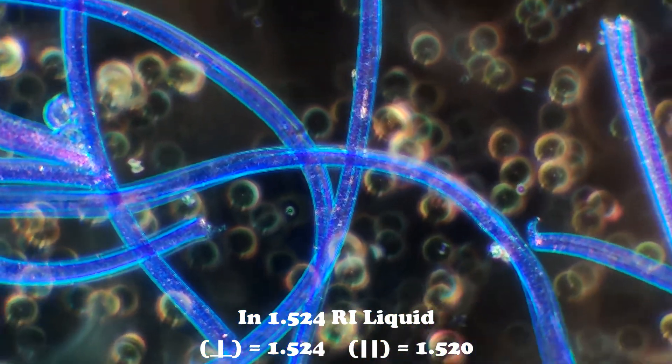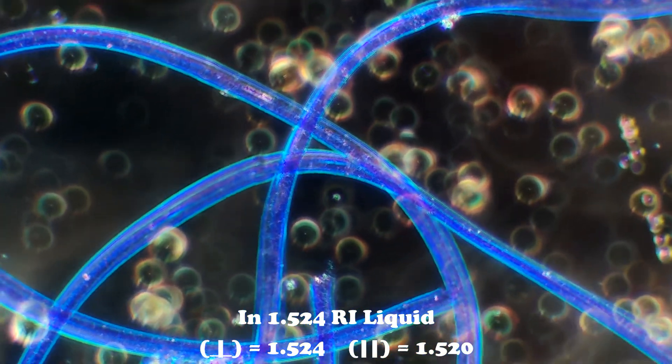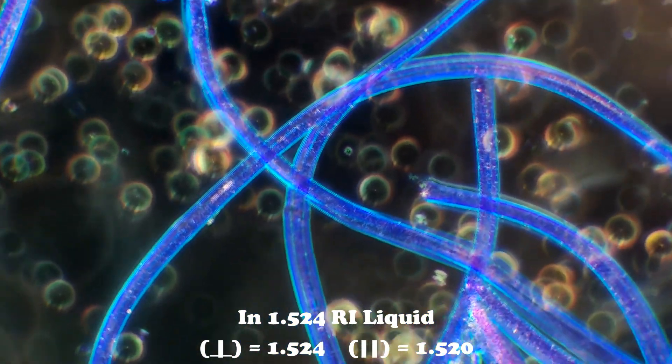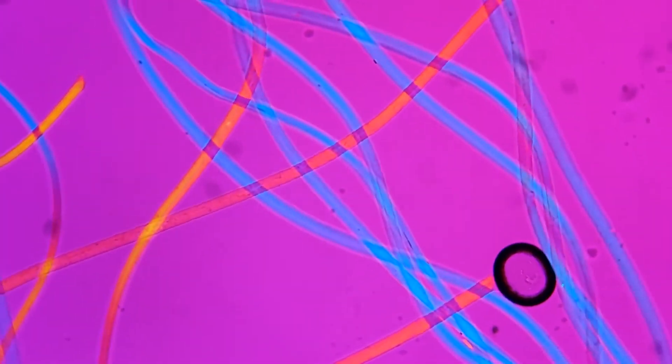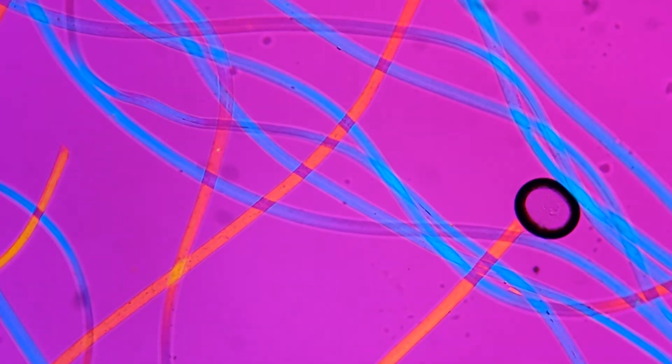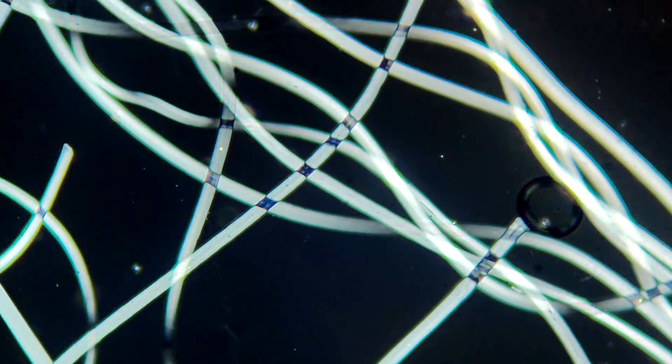Let's see that effect when we place the fiber in its like refractive index of 1.524. The same holds true for acrylics with an oval cross-section that you might find in clothing.